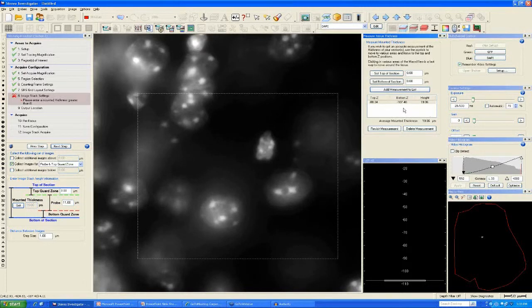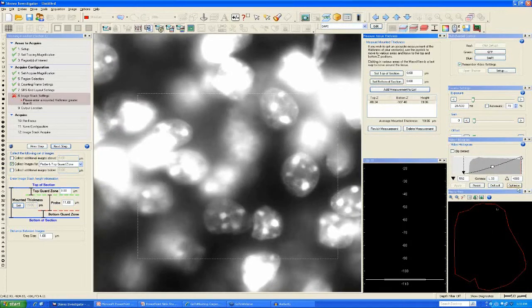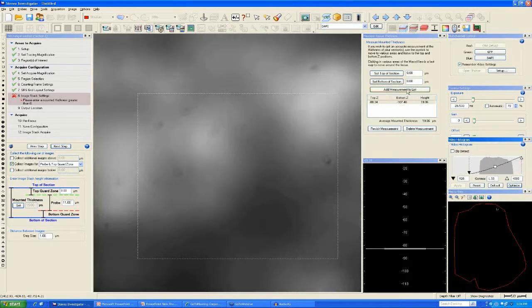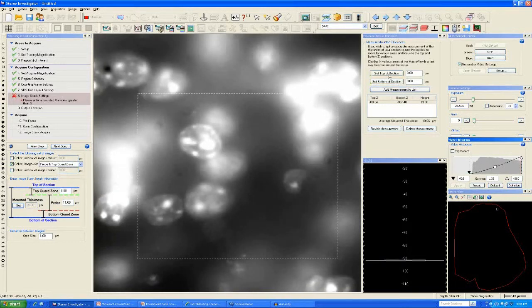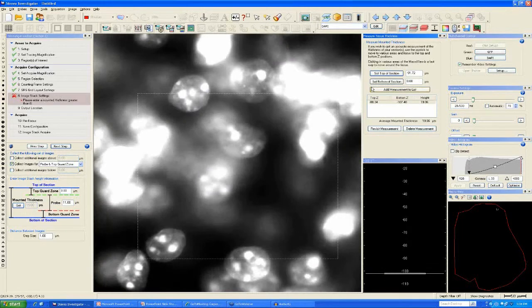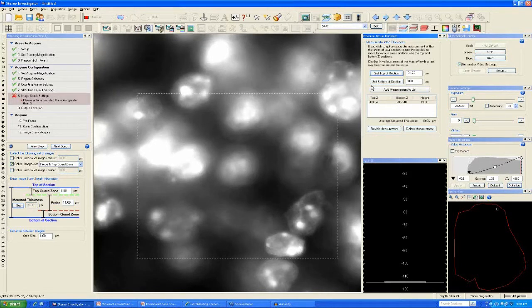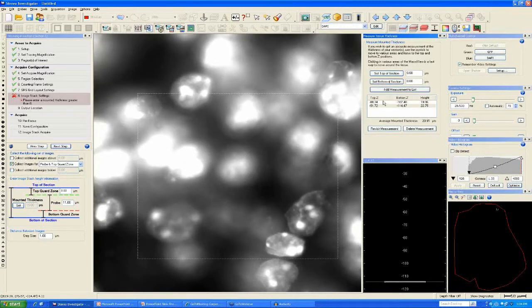We recommend measuring thickness at various locations. One easy way to do this is to click anywhere inside of your contour in the macro view. You could then go to a location distant from the one you just measured and repeat the operation. As you can see, the software begins to calculate the average mounted thickness and export that over to the mounted thickness in the Enter Image Stack Height information box.